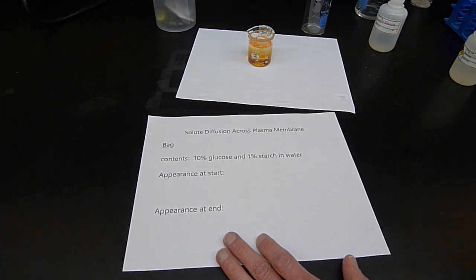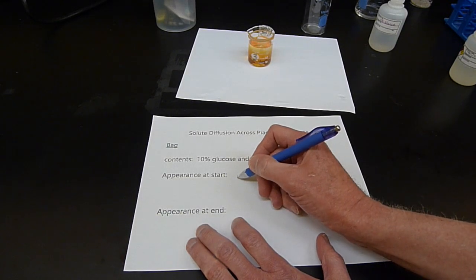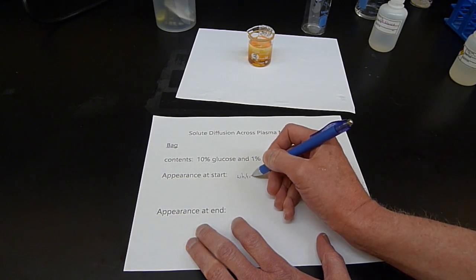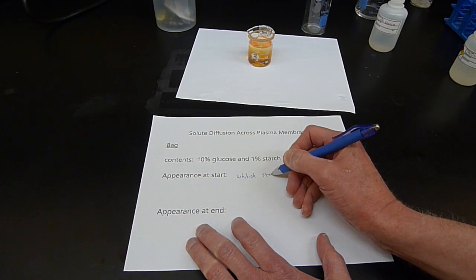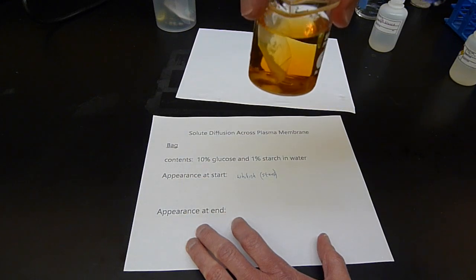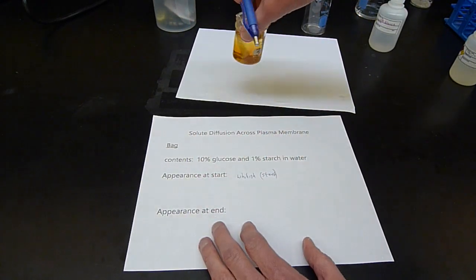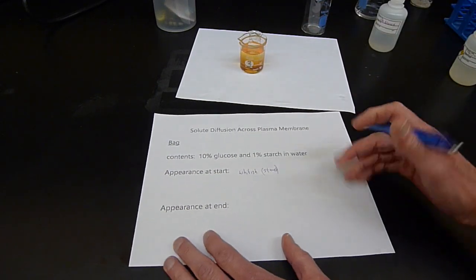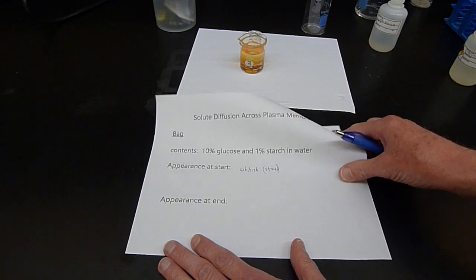In the bag, at the beginning, the appearance of the starch is whitish, and you can still see that. You can see a little bit of the white there from the starch in that bag. And then we're going to record the appearance after this has been sitting around for a while too.